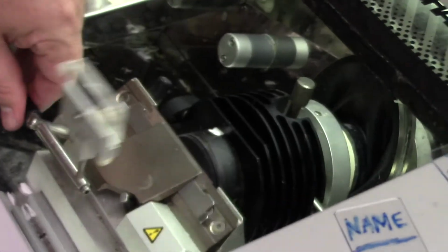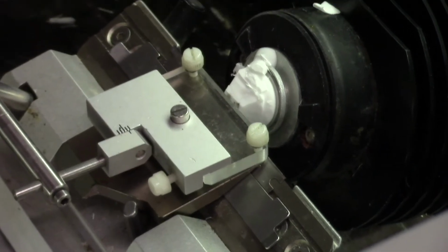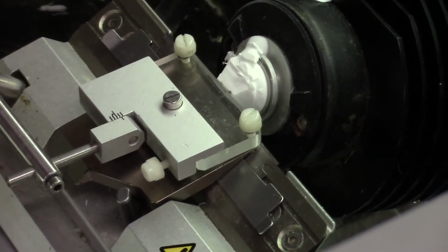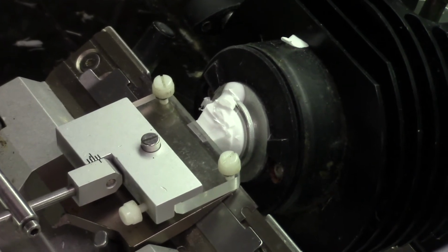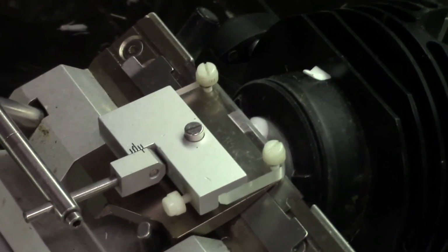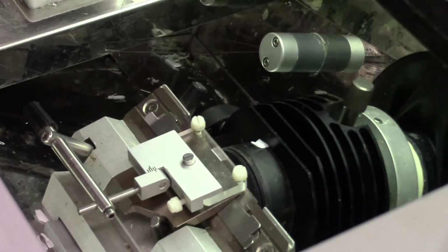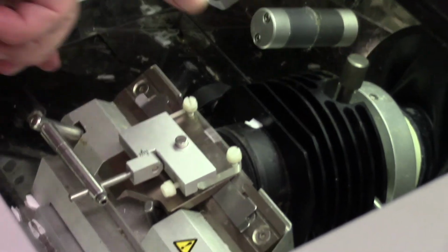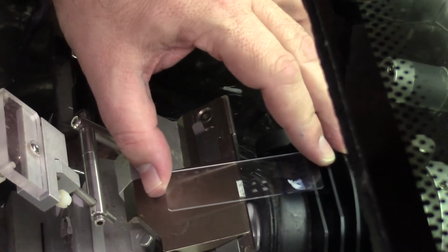Oops, I better cut the next section before I try to pick it up. And I'll go fast to here, and then slow from here. Inch it under the glass. See if I can pick it up with my left hand. And there you go.